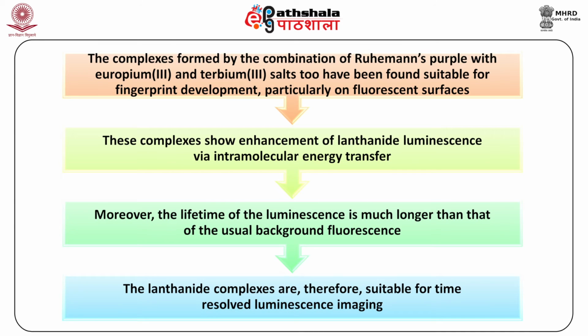The complexes formed by the combination of Ruhemann's purple with europium and terbium salts too have been found suitable for fingerprint development, particularly on fluorescent surfaces. These complexes show enhancement of lanthanide luminescence via intramolecular energy transfer. Moreover, the lifetime of the luminescence is much longer than that of the usual background fluorescence. The lanthanide complexes are therefore suitable for time-resolved luminescence imaging.